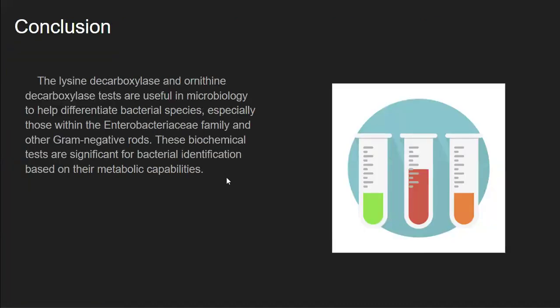Conclusion. The lysine decarboxylase and ornithine decarboxylase tests are useful in microbiology to help differentiate bacterial species, especially those within the Enterobacteriaceae family and other gram-negative rods. These biochemical tests are significant for bacterial identification based on their metabolic capabilities.